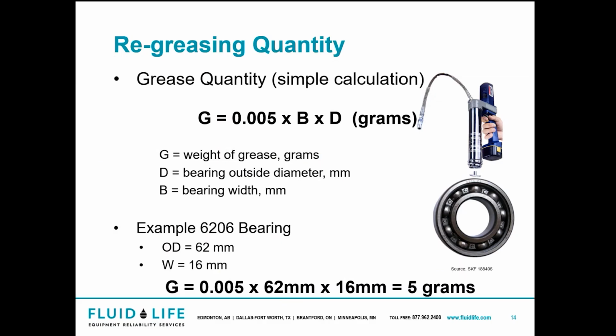Now, this is how we start determining our grease quantities. We want to know grease in mass rather than shots or pumps of grease, because each different grease gun could pump out a different volume. You could squeeze one or press the button on an electric greaser, and they could have different volumes pumped out. So a good idea to start with is calibration.